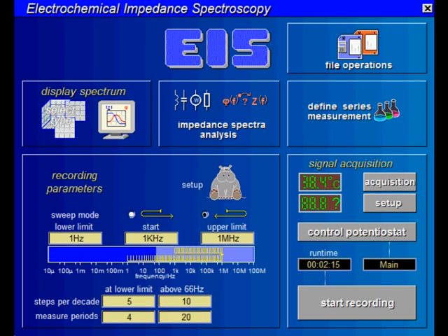This is where you set the sweep mode. If you decide to double the lower frequency range instead of the upper, please take into account that low frequency measurements take a lot more time than high frequency measurements. This is where you set the number of measurement points per decade as well as the number of shots per measurement. You can set these parameters separately for the higher and the lower frequency range.